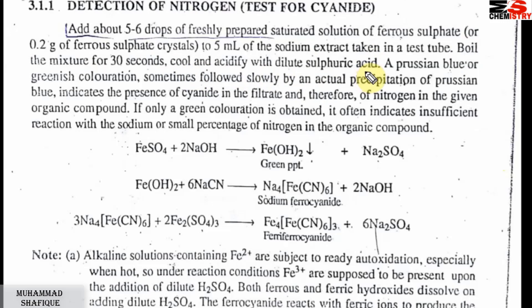A Prussian blue color or greenish coloration, sometimes followed slowly by an actual precipitation of Prussian blue, indicates presence of cyanide in the filtrate and therefore of nitrogen in the given organic compound. Prussian blue color means cyanide is present in the organic compound solution. Nitrogen is detected this way.